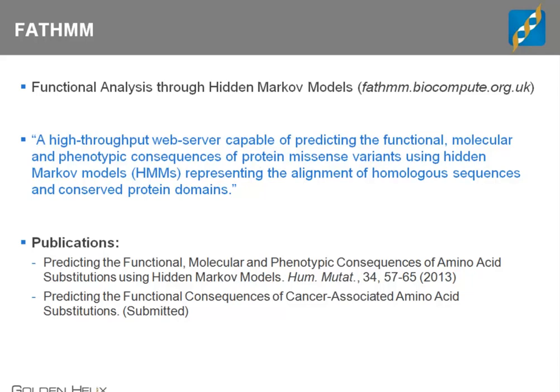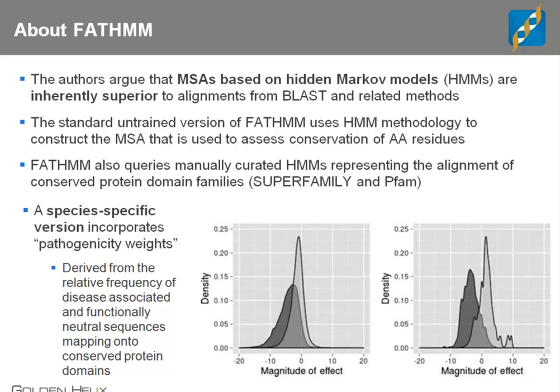And so the last one we'll talk about here is Fathom. Fathom is very new. It comes from the University of Bristol in the UK. And it's new enough that it still hasn't really started to generate any citations, so it's hard to tell how much it's getting used. But the thing that really separates it from the others is that they use a different technology for building the sequence alignment.